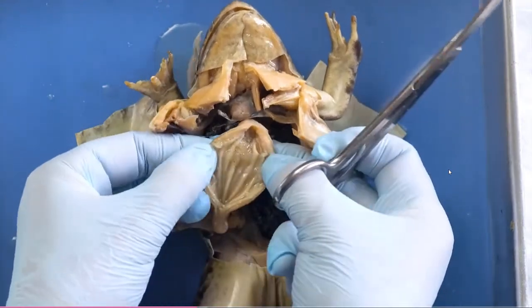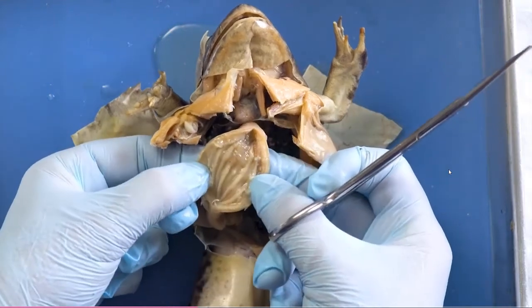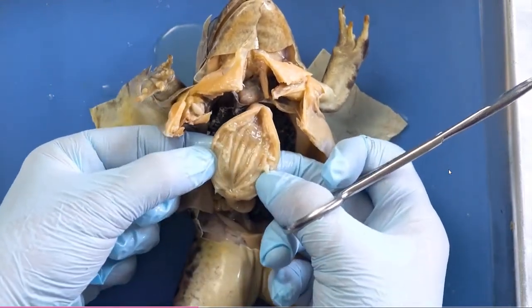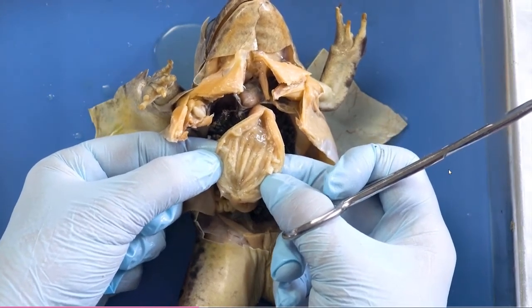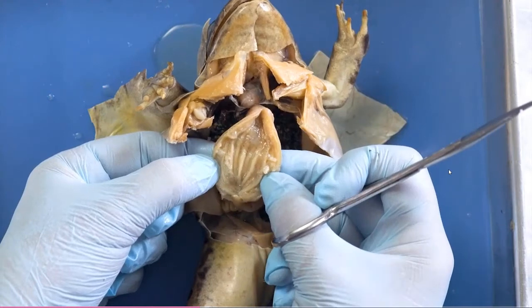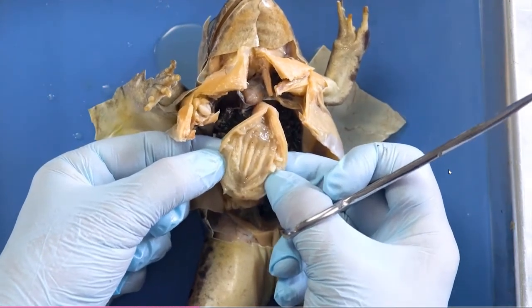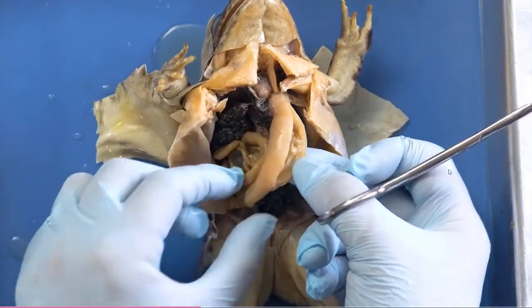And I do notice something that is not at all discernible about what it is or what prey item it might be. But I noticed these ridges or grooves in the stomach. These are called rugae. And this will be a structure that we'll definitely want to ask our students to note in their science notebooks and guess or predict about the function of the rugae.